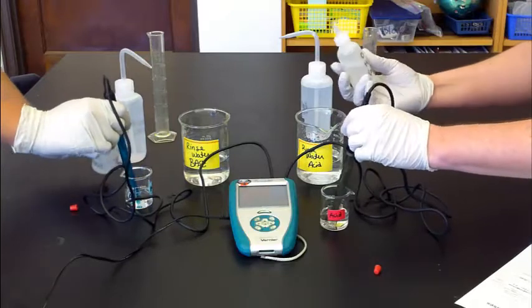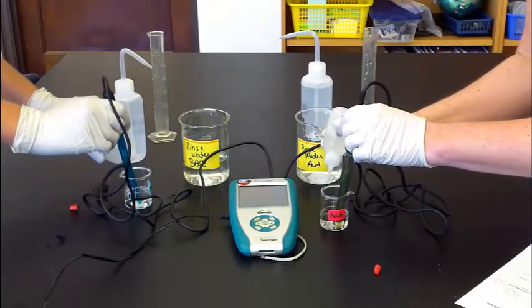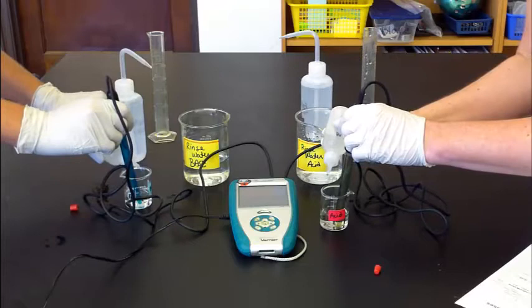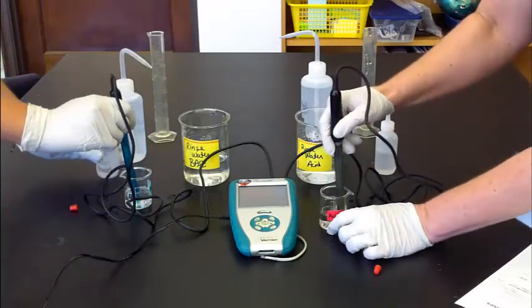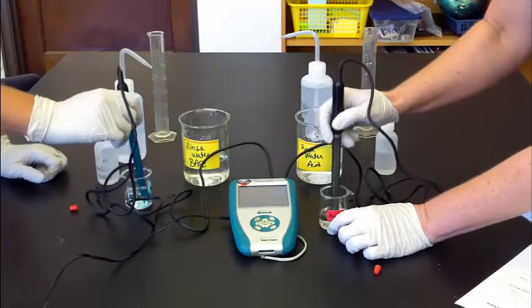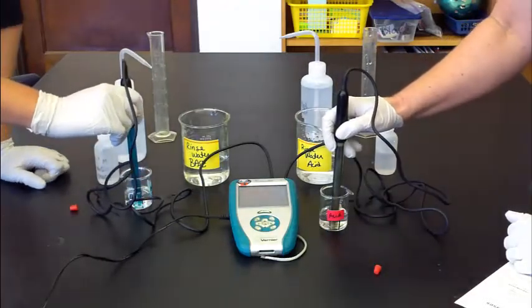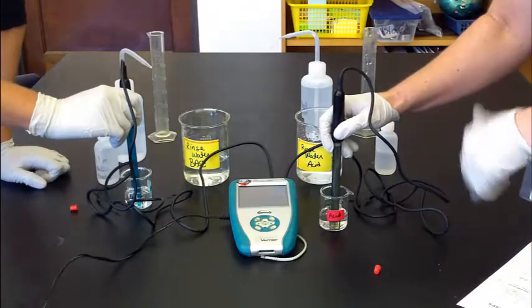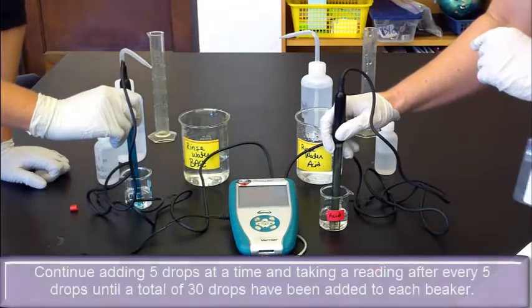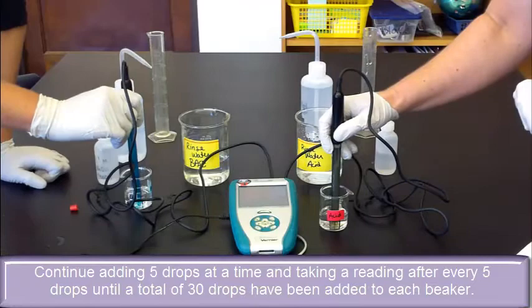And then you can put in five more drops: one, two, three, four, five. You can even use the probe to stir. Keep it still, take your second measurement, and then you will keep doing that five at a time until you reach a total of 30 drops.